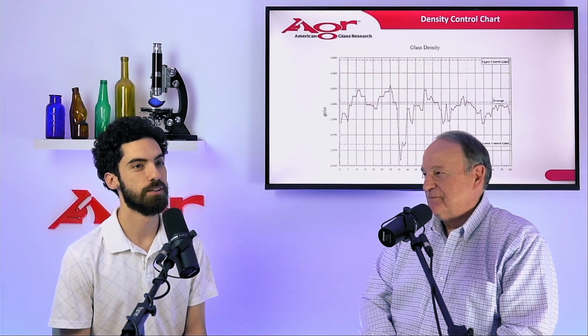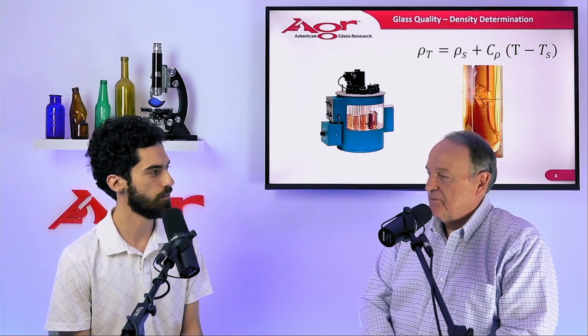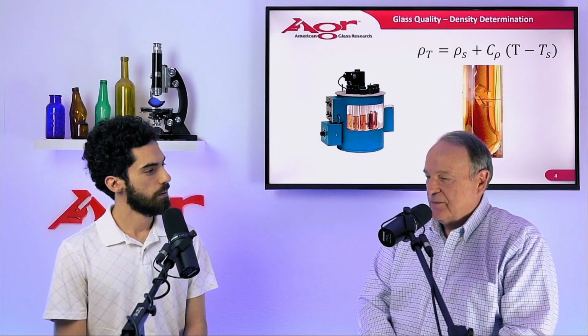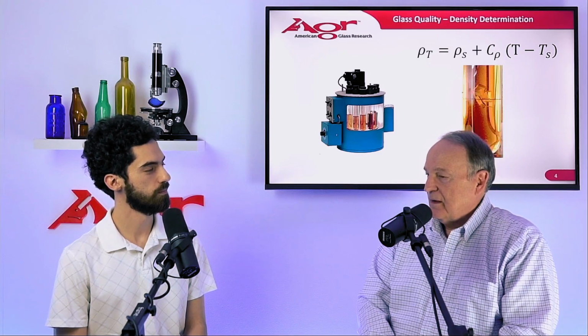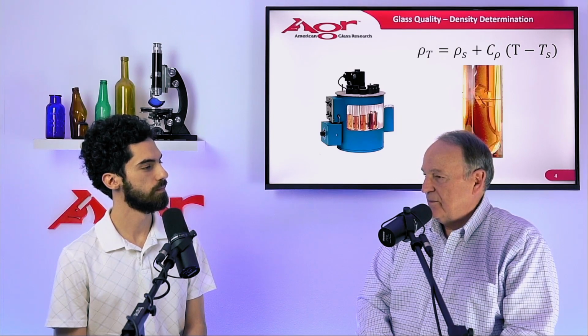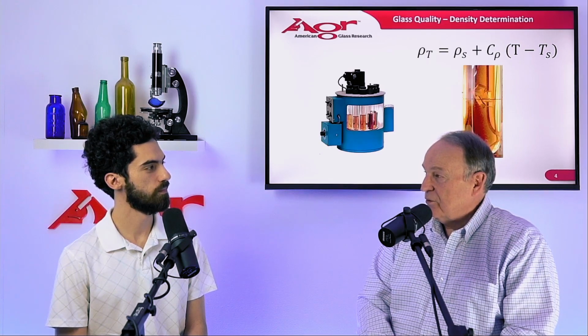Oh, yeah. But we want to talk about the density comparator, right? That's correct. So let's talk about that. In fact, we have an image of a density comparator here. It's a fairly simple device altogether. It is a simple device. It consists of about a 5-gallon tank of water into which are inserted test tubes, a little bigger than normal test tubes, that contain a mixture of oils.